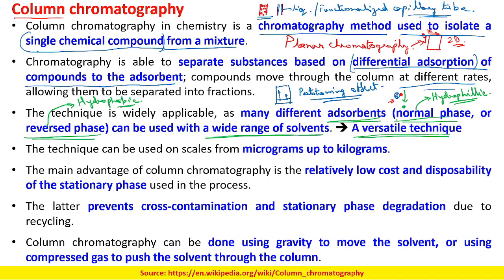Depending upon the shape and size of your column, you can separate from micrograms of your analyte even up to kilograms.